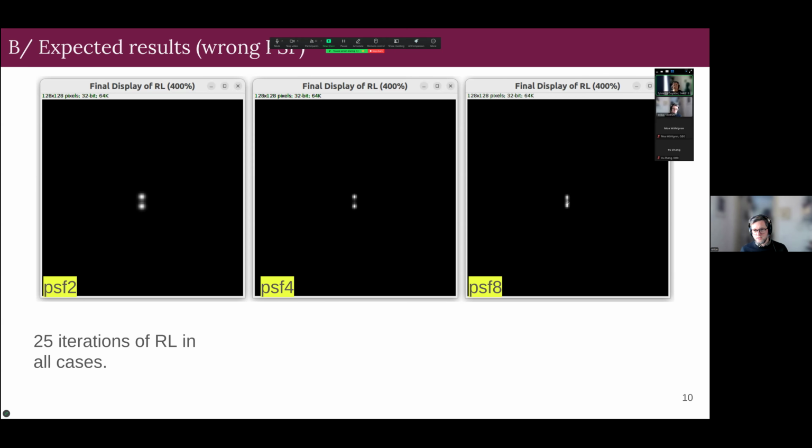In that case, you will probably notice, regardless of the number of iterations, that there will always be something between the dots. That's because the PSF is so large, it covers both spots. So yes, there will be something in between. I show this just as a precaution that it's very sensitive to the PSF. In this case, it's just the 2D PSF, and in 3D, it's even worse.